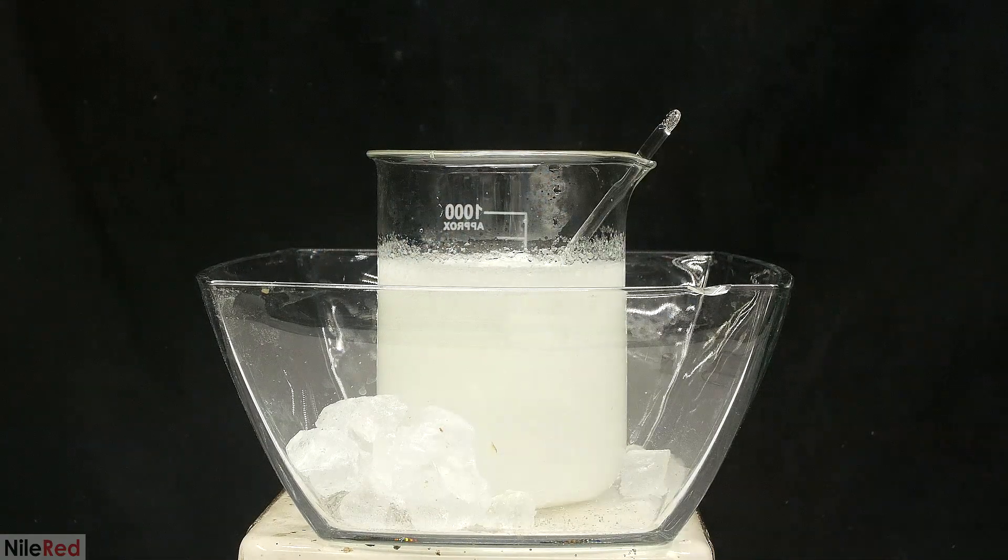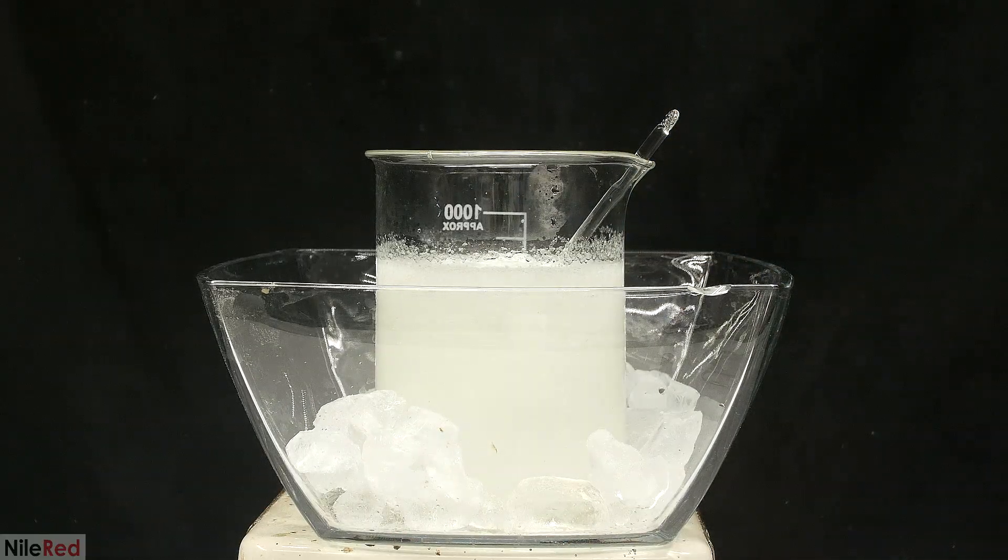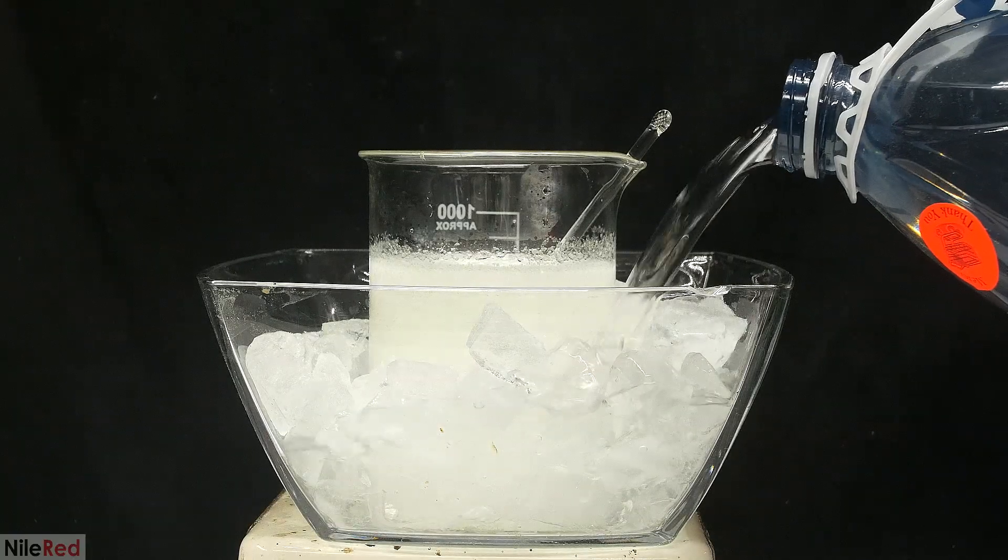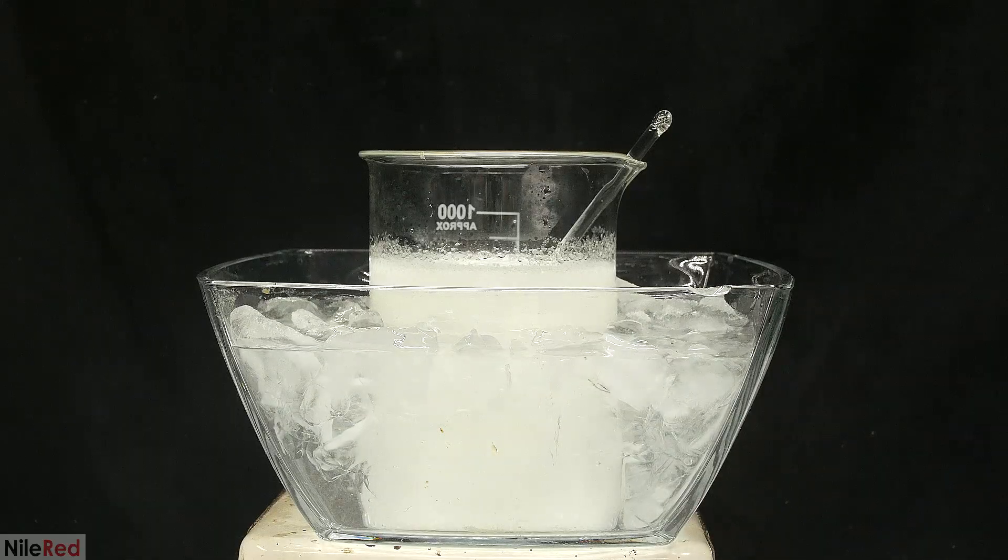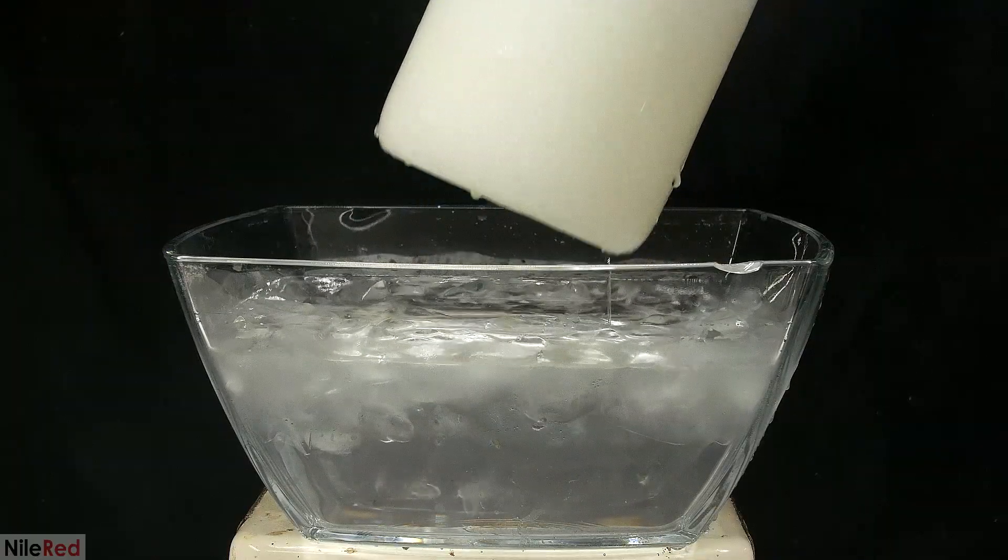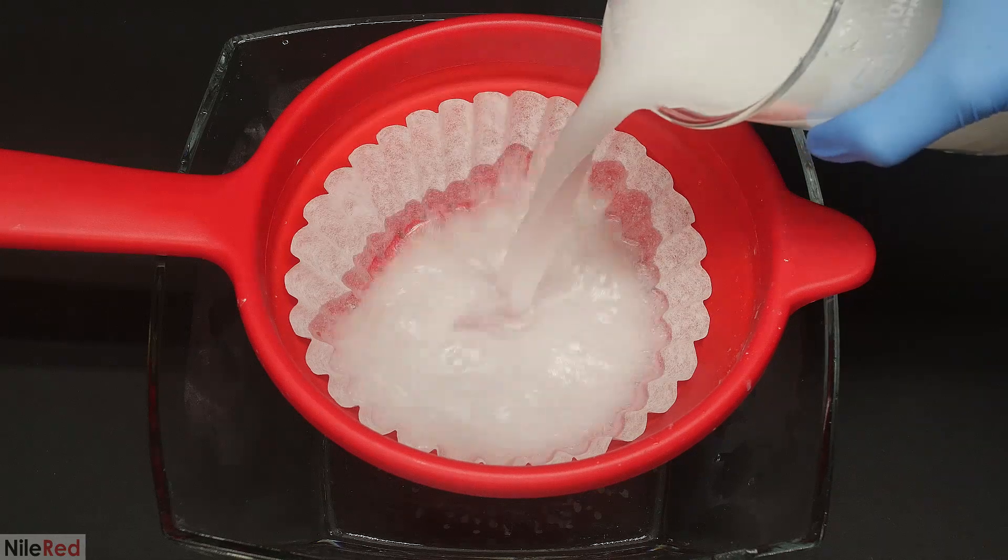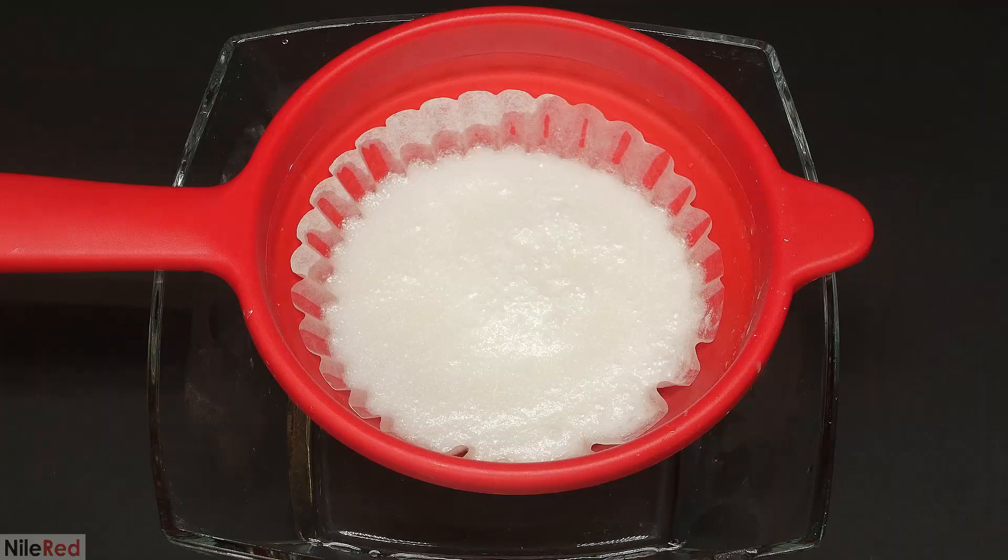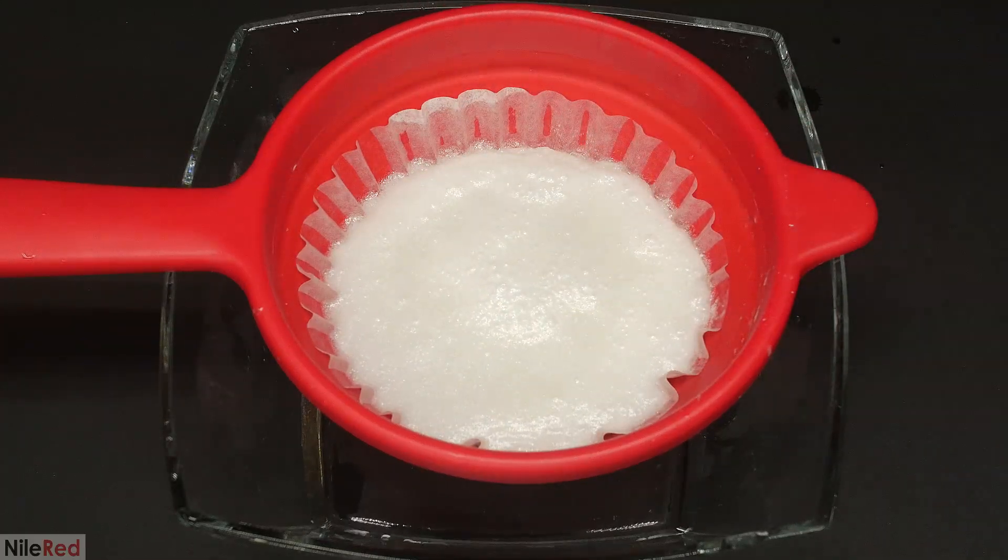To reduce the solubility of acetanilide and precipitate as much as possible, it now needs to be cooled to around zero C. I decided to do this using an ice bath, but it's also possible to just put it in the freezer for a little bit. I let it sit for a couple hours and at this point it should be done. All of the acetanilide is then separated using just a coffee filter.